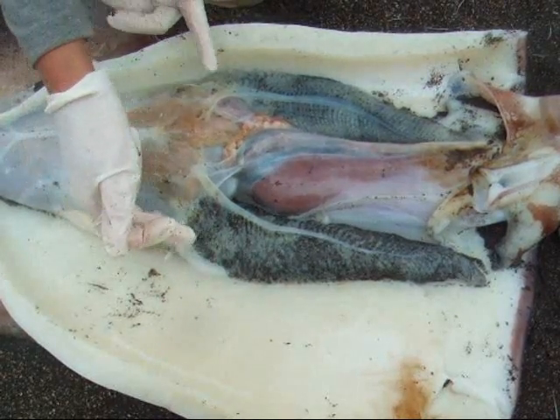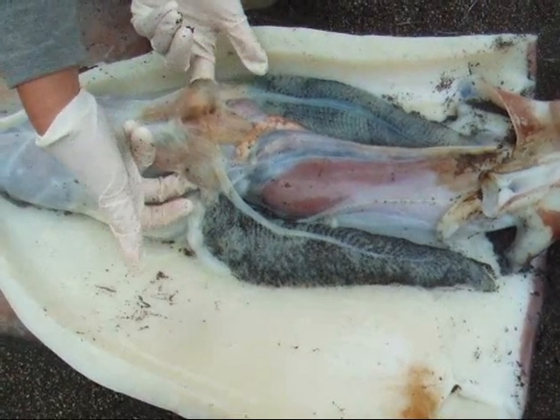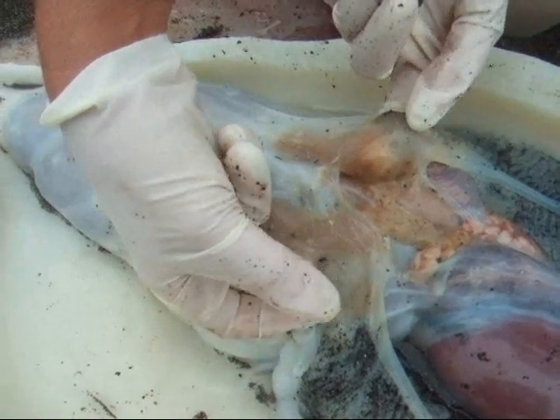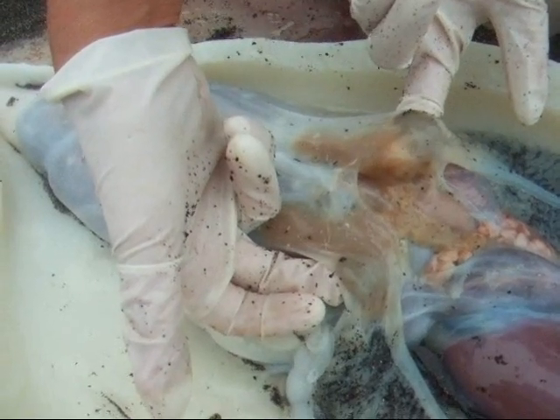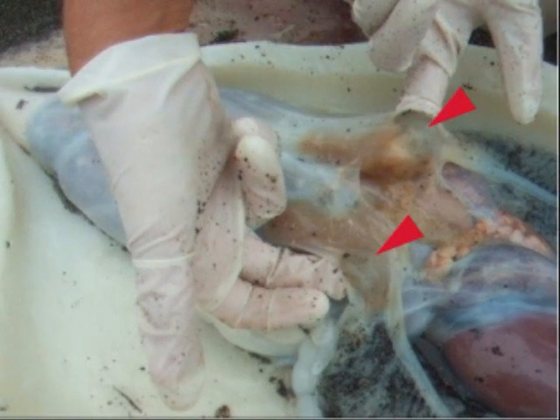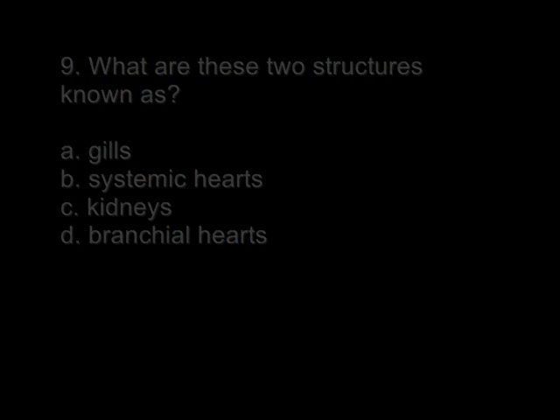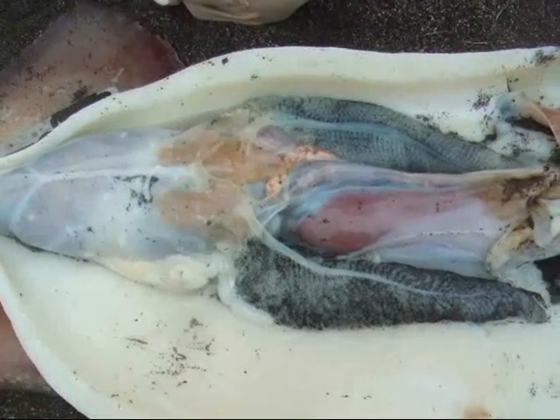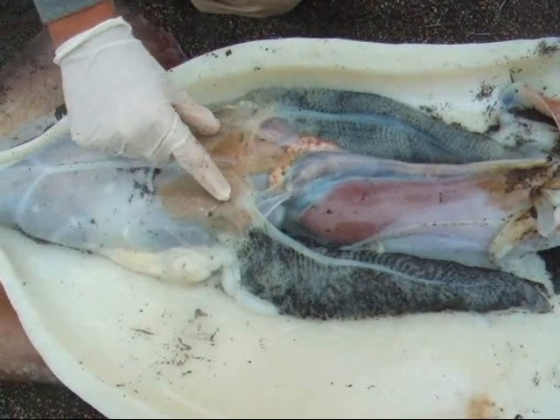They are connected to 2 other structures right here. What are these two structures? Those two structures then lead to two more structures right here.